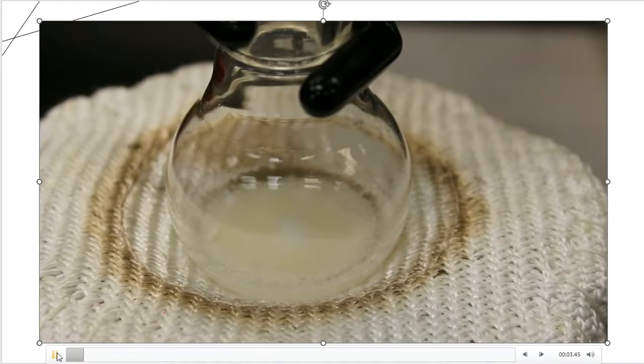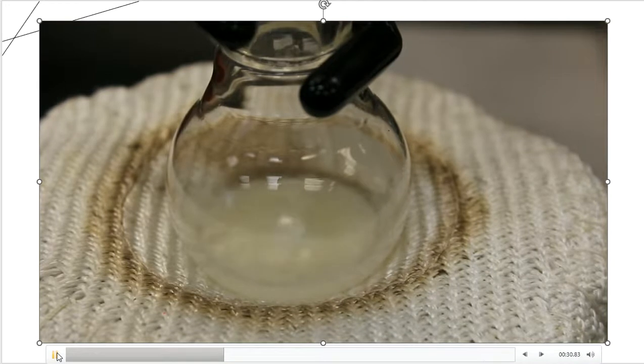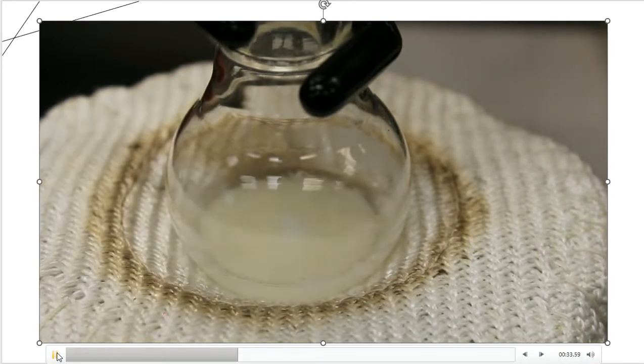Okay, so we're on our next step, and we're getting ready to add the acetic anhydride that you saw in the separatory funnel just a second ago. So I'm going to open the separatory funnel up just a little bit, and I'm going to allow this stuff to drip. It says very slowly, like 1 drop every 3 seconds, give or take from there. So that's really kind of an idea or a hint to go slow with this. Again, if I generate a lot of heat, I don't really want to have that problem. So I'm just going to allow it to kind of do its thing, drip, drip, drip, very slowly down into the flask.